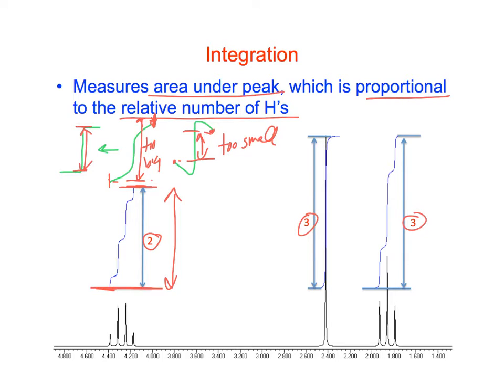So if the integration wasn't looking so good, like one like this or this, what could you maybe do other than adjust the whole thing to get a more appropriate or a better integration value? Besides doing the adjust phase, you could pick different spots to start from. Right, instead of starting way over here, you could cut it right at the inflection point from here to here, and then you get a much better value. Or on this one, you could cut it from here to here.